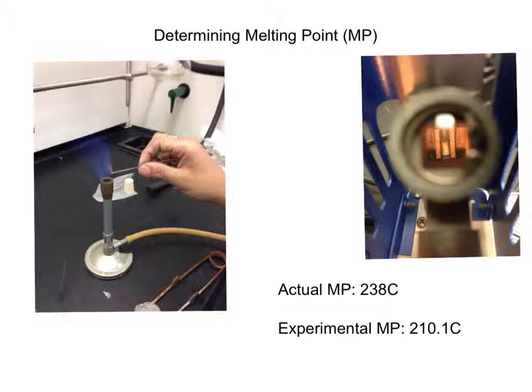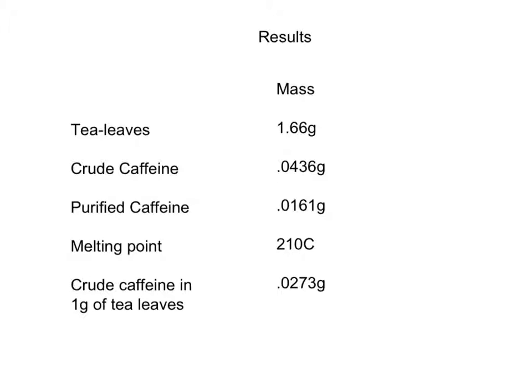Error could have occurred during the sublimation process. When we placed the ice on the centrifuge tube, water could have condensed outside the ice, and then we sublimated our sample, and when it recondensed on the wet surface, it could have gotten wet, and then melting it would have given us a lower melting point, which would explain our decrease in temperature.